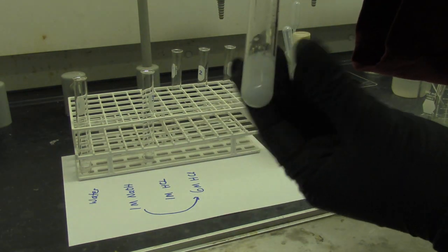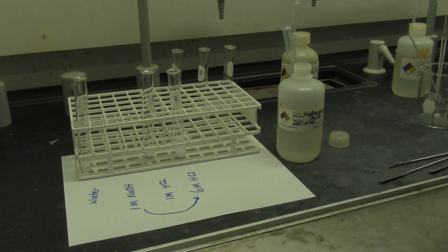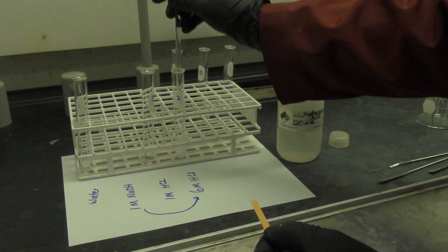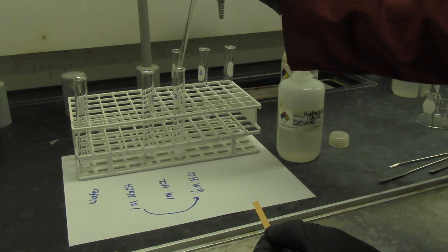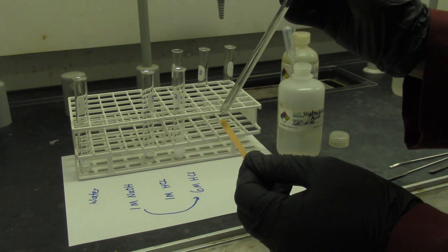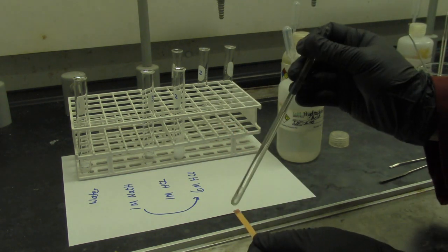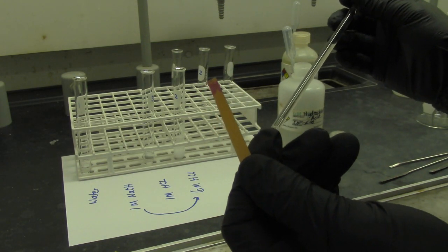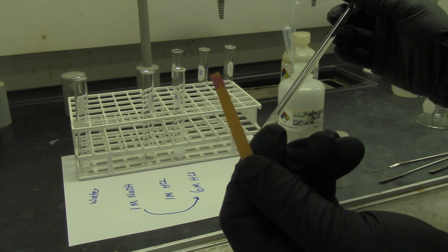Ooh, it's a little bit warm. And we'll test the pH of the solution. Take one dip with the stirring rod and put it on a litmus test paper. Take down the observation. Acidic.